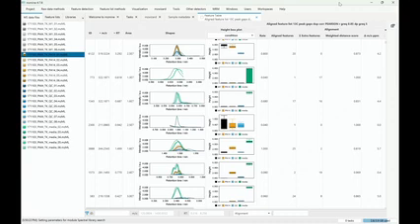So you have a great tool, and the wizard is very great to process the data, like deconvolution and alignment. But when we came to the spectral annotation, the annotation level is very low compared to other tools, I think. So how do we increase the spectral annotations by comparison to the library? Is it about using multiple libraries or going with molecular networking?